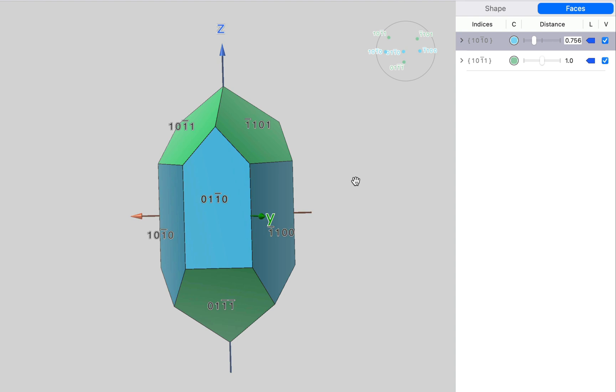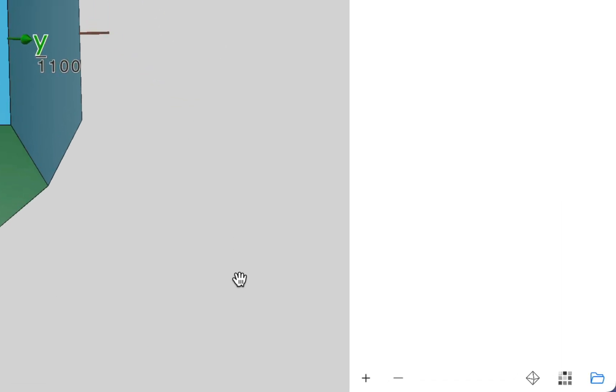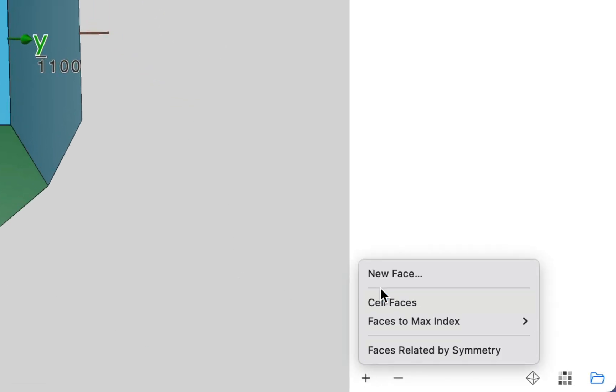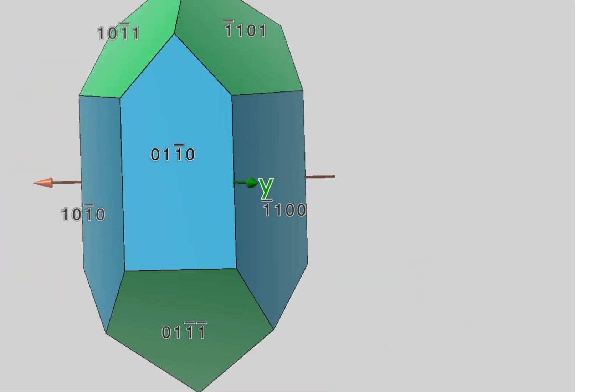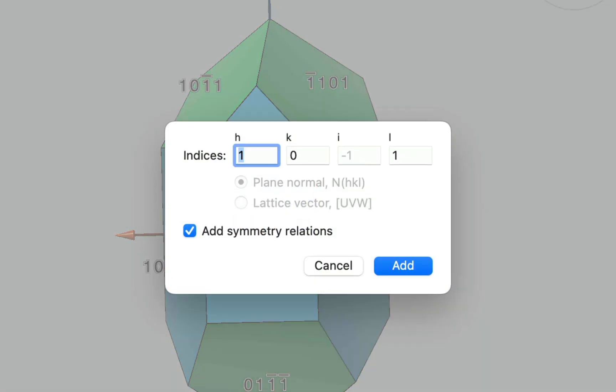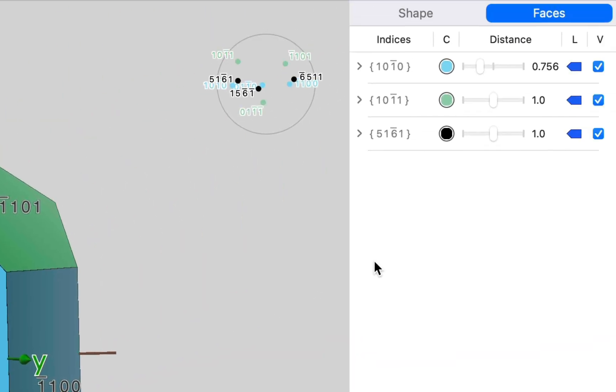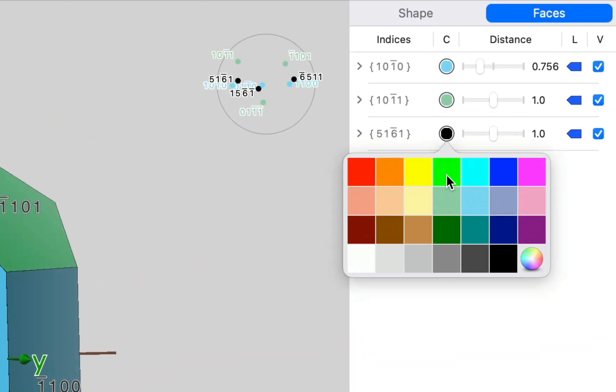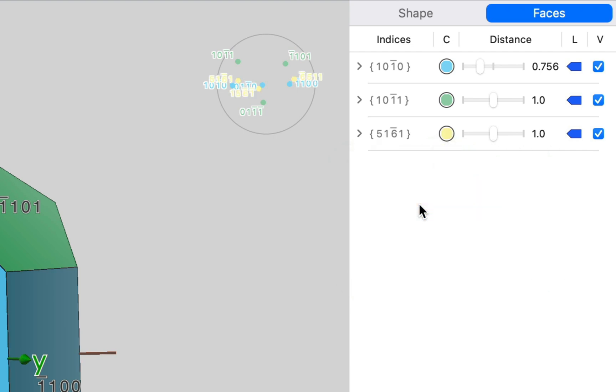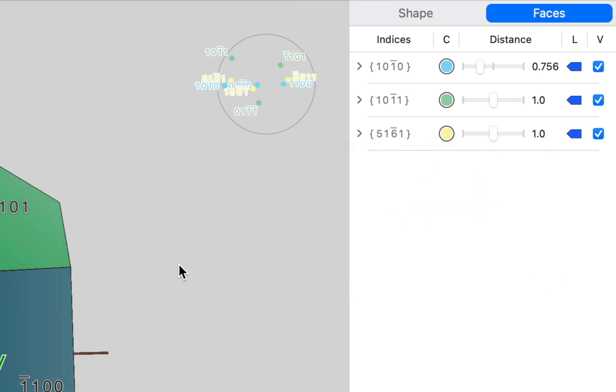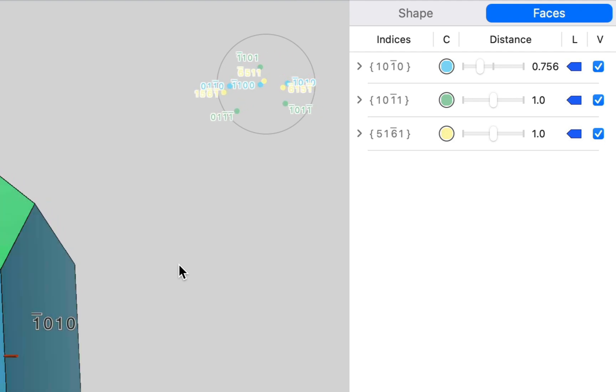Now, it turns out that quartz crystals typically have some other faces as well. And we're going to add those. So let's add a new face. And I'm going to add a face parallel to 5, 1, bar 6, 1. And the symmetry relations. There it is. Let's choose a color for that.